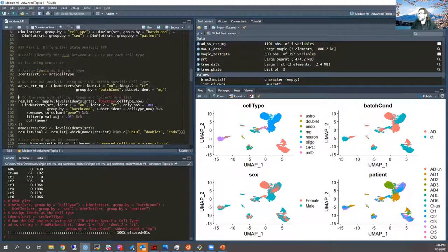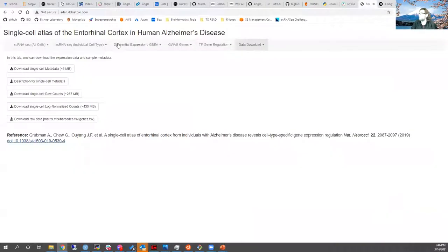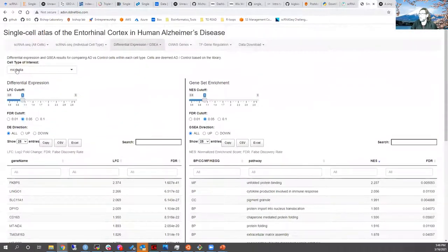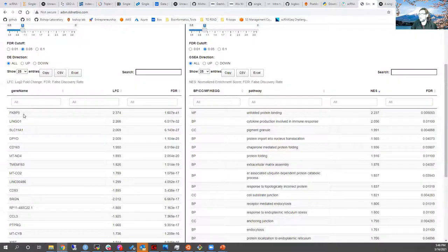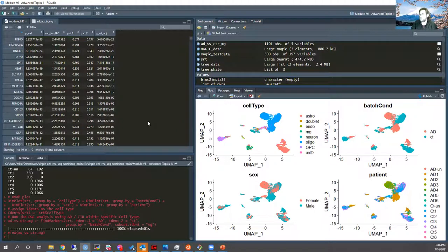And there you go — we get our results. Looking at our top hit: FKBP5. Going back to the paper's microglia top hit — also FKBP5. So we're at least seeing something similar. There are certainly differences, and since they didn't really give their methods, we don't know exactly how they did their analysis, but we can assume it was by a relatively similar approach.